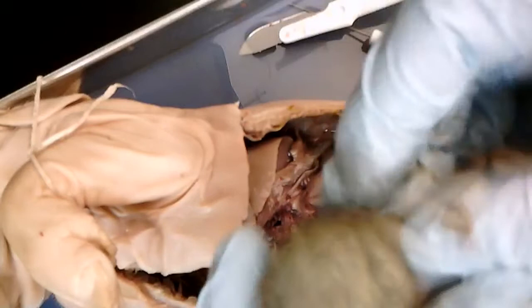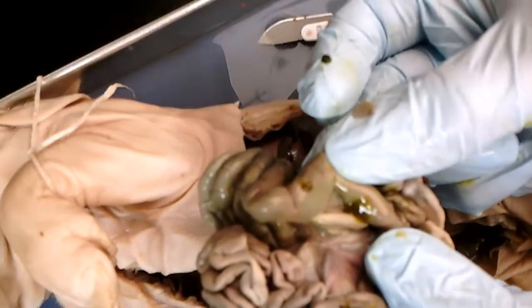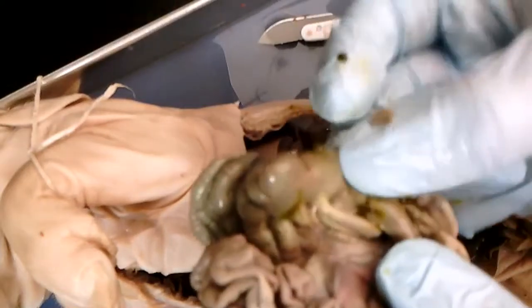You find the cecum with that now? I bet that's it right there. Here. Yeah, cecum. It's centered on the screen. Right there. That's the cecum.